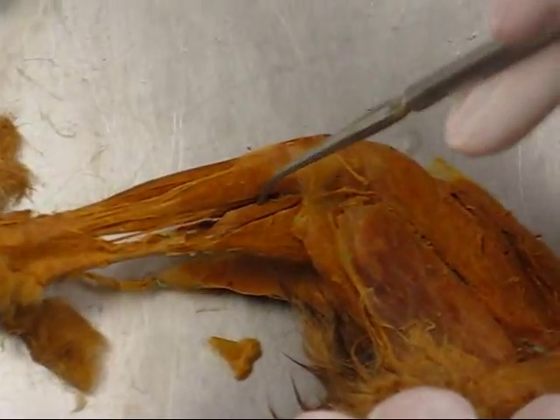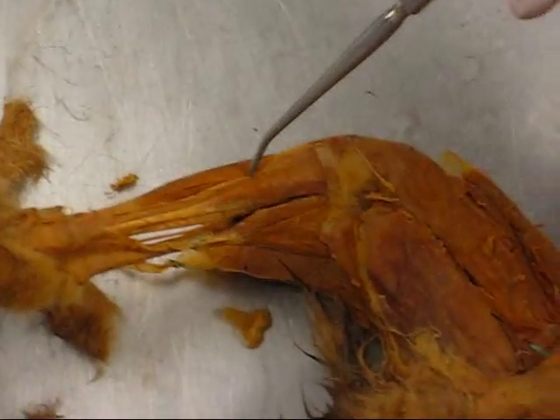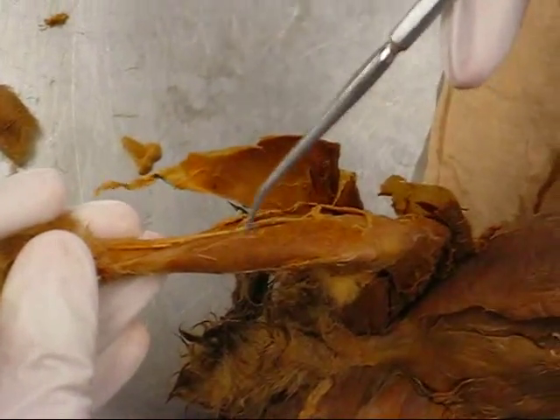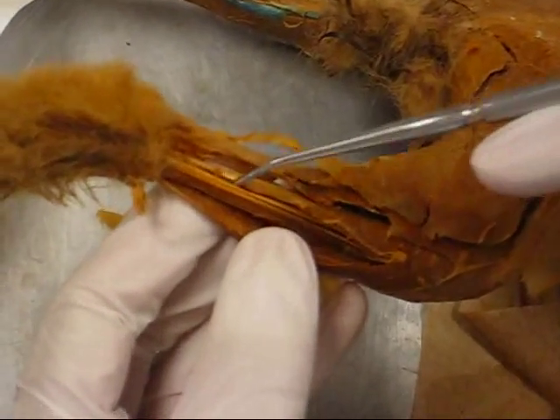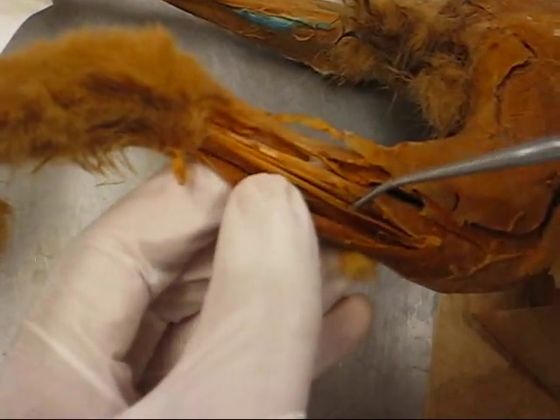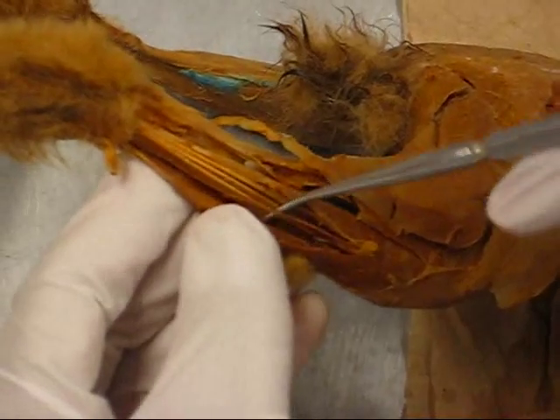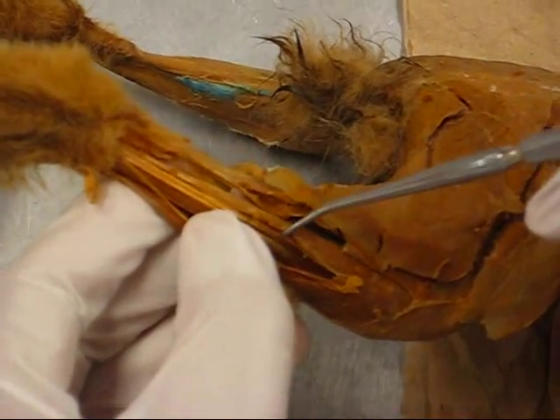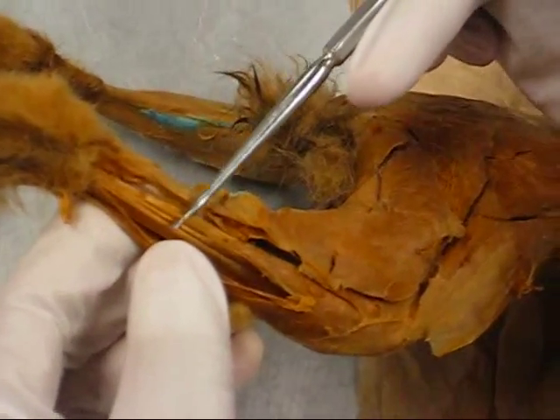Gastrocnemius, plantaris. This one is the tibialis anterior. Underneath that is the extensor digitorum longus. Here you have the peroneus group — peroneus longus. This one is the peroneus tertius.